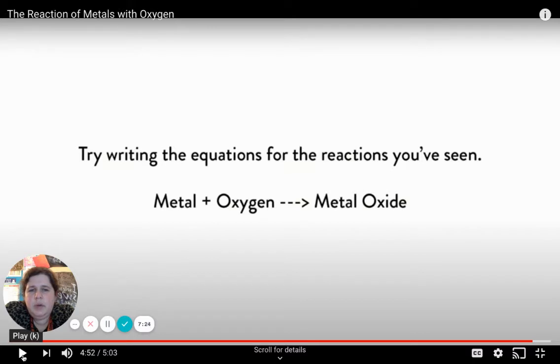So, all right, take a moment. Try writing out the equations for the reactions that you've just seen. In each reaction, you have a metal, like iron, reacting with oxygen, O2, to make a metal oxide. So think about what type of reaction you get with two reactants becoming one product. Hint, hint. Okay?